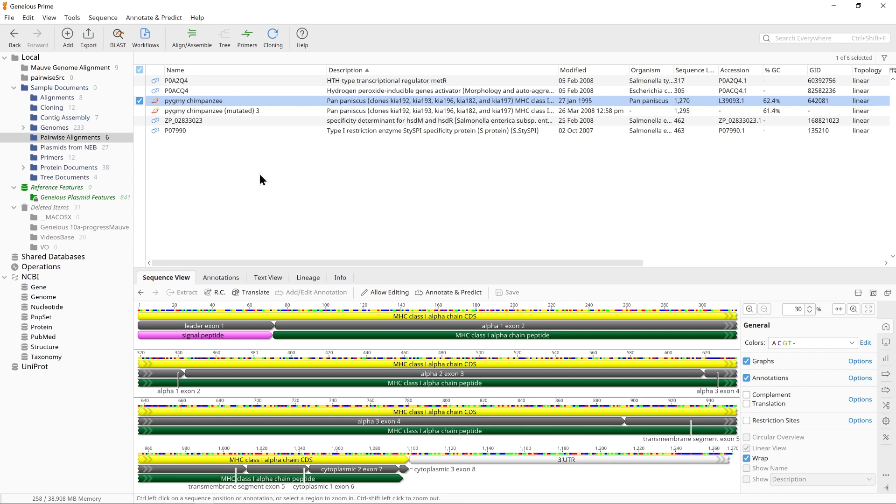A dot plot marks matches between two sequences on a two-dimensional grid. Runs of identity will produce diagonal lines on this grid.